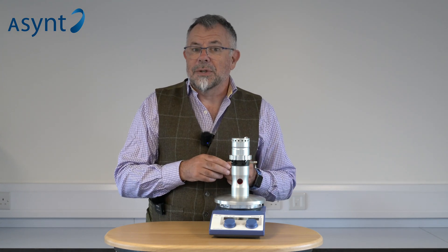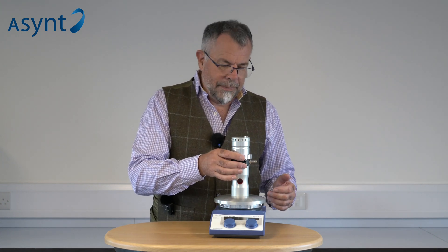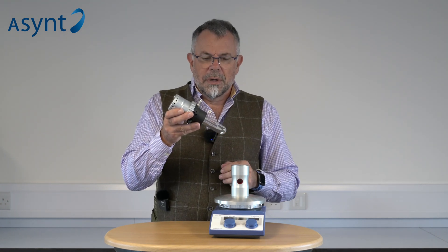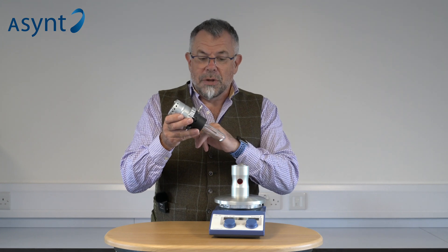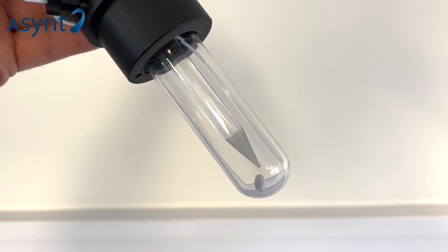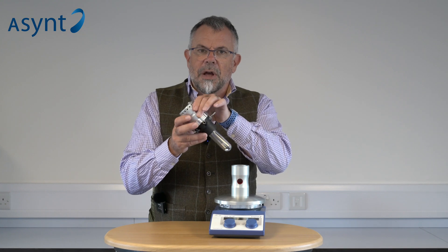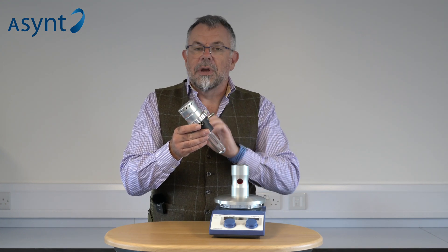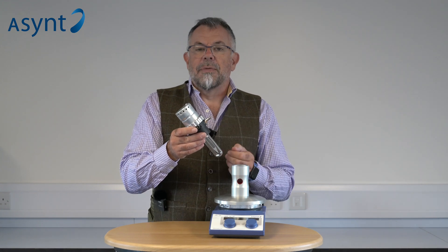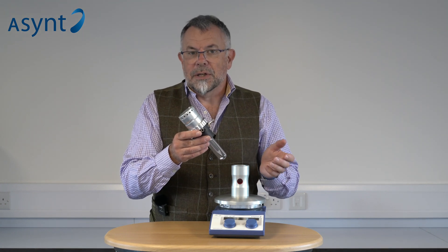Let's get on with the product as it is. These are available now — let's have a look. It consists of a reactor tube. Inside you can see there's a quartz rod with a section at the bottom that's ground to allow the light to exit. We have a very high power 10-watt LED, with a colour choice available to you — anywhere from 365 nanometers up to 600 nanometers, popular choices being 365 and 450.